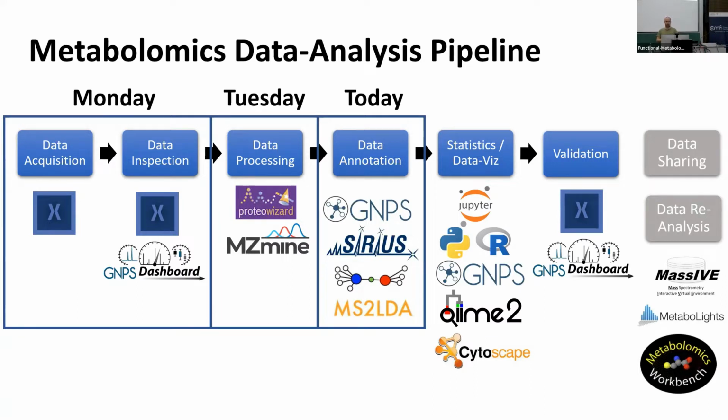Later on, Kai will walk you through Sirius, which you will see has different tools for in silico annotation. After that, Madeleine and Justin van der Hooft will showcase MS2LDA. Afterwards, we might move already a little bit into the visualization part, and I will show you how to merge these multiple layers of annotation within Cytoscape. But before we move on, I just want to reiterate the feature finding from yesterday.